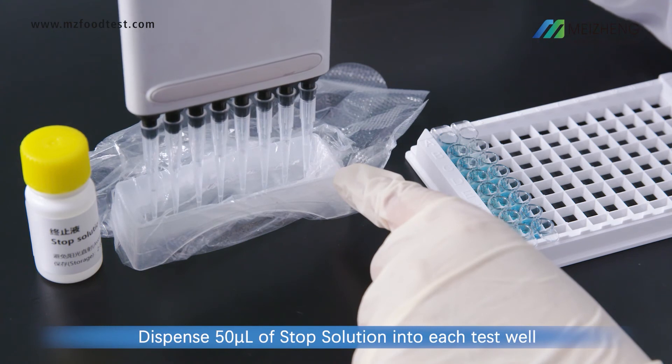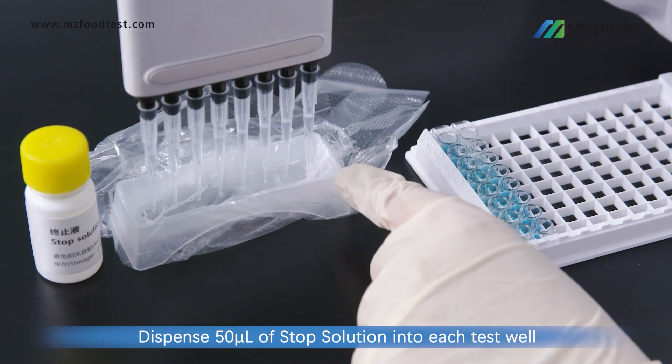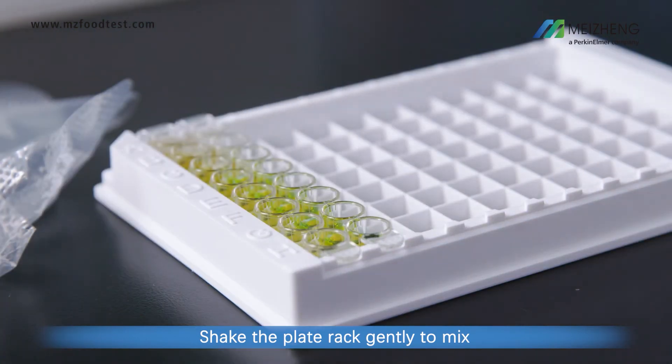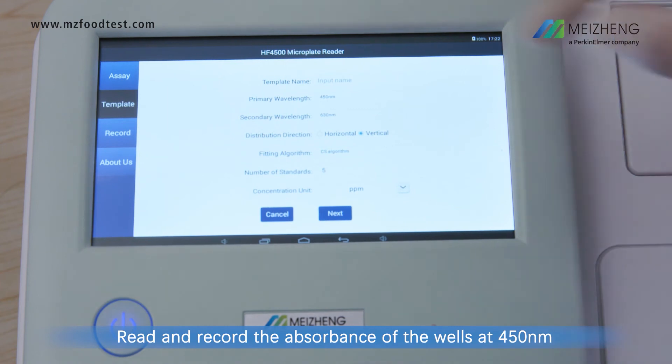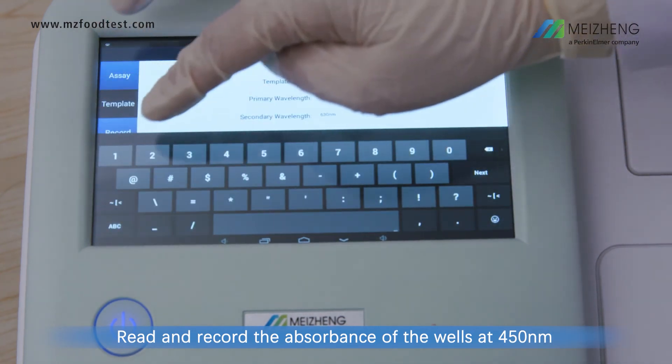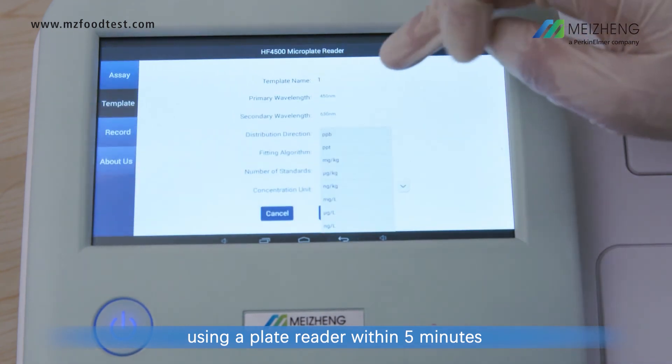Dispense 50 microliters of stop solution into each test well. Shake the plate rack gently to mix. Read and record the absorbance of the wells at 450 nanometers using a plate reader within 5 minutes.